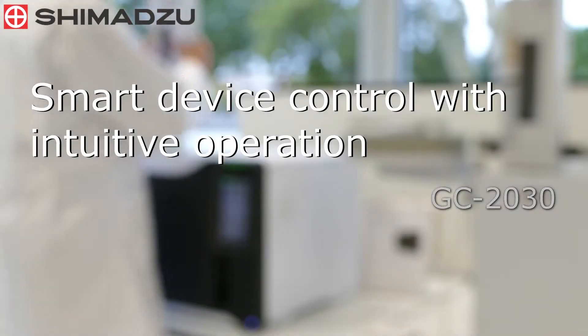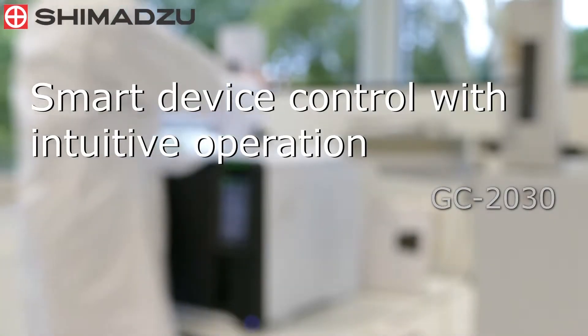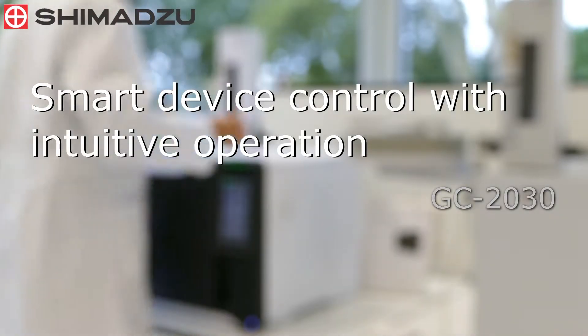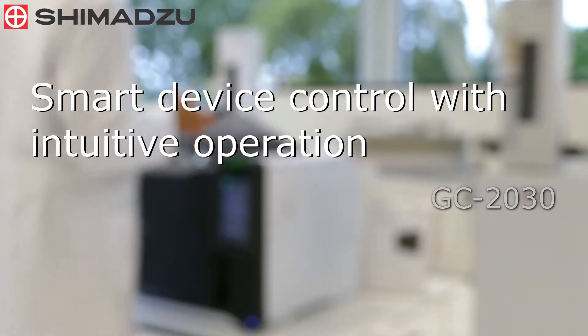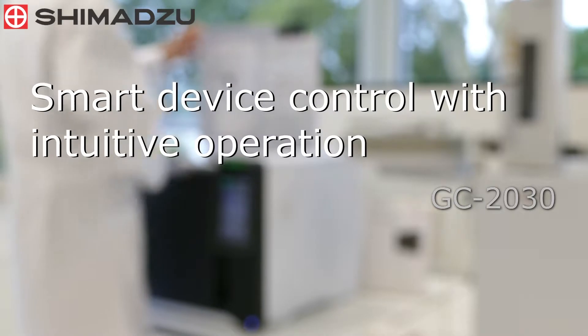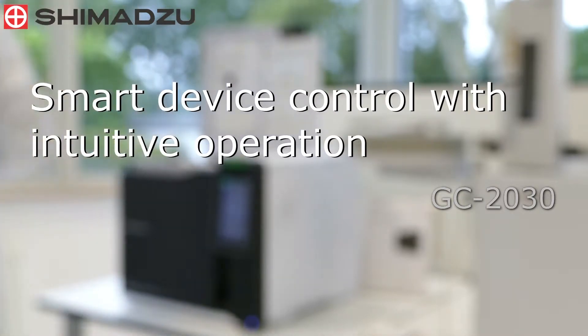The new lab solution software offers intuitive operation with an updated graphical interface. This can also be found on the touchscreen of the new Nexus GC2030.